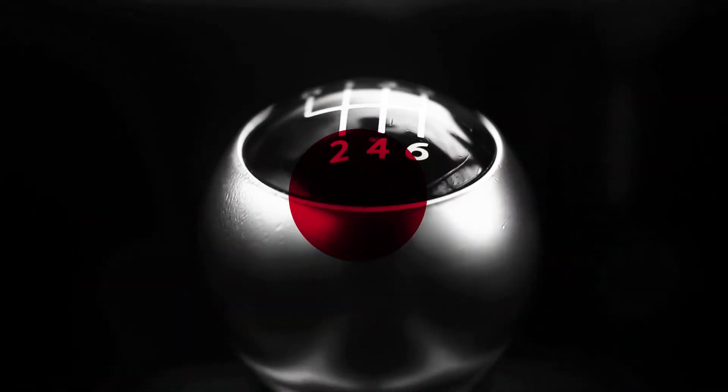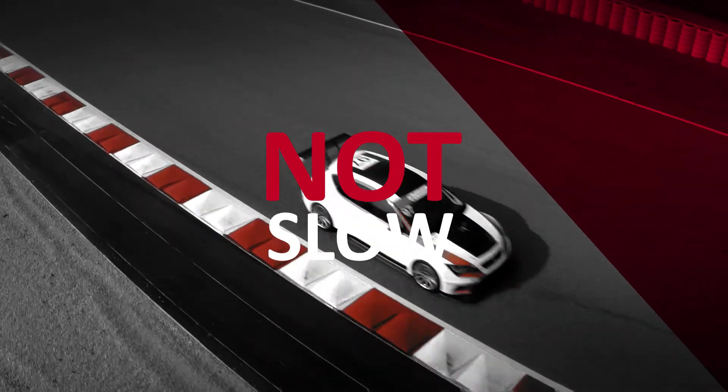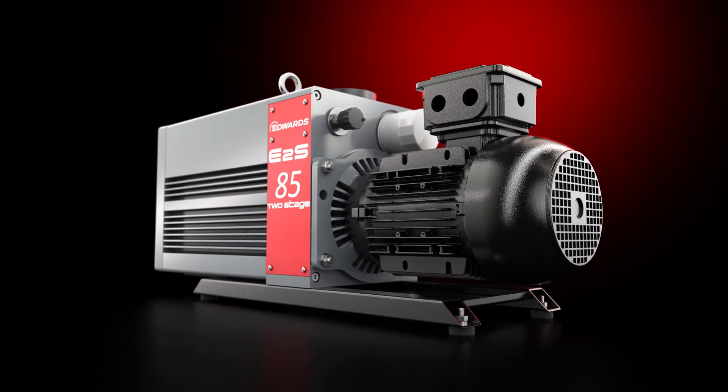Best of all, the E2S does all of this at a blistering pace. Because this is not a slow pump. It will reduce cycle times and increase your production yield. Edwards' E2S — no doubt, no fuss, no ordinary vacuum pump.